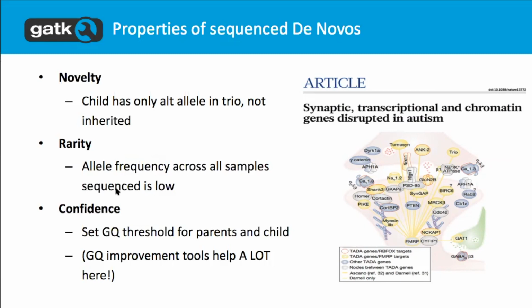We impose that the allele has to be rare, because if you have a common allele, it's more likely to have been inherited through some other route, as opposed to arising de novo in the child. And one case that has been observed is if you have a parent who has a mosaicism, where they get sequenced and you can't pull out the variant from them. The genotype is homozygous reference, but some of their tissues are mosaic and actually have some variation.